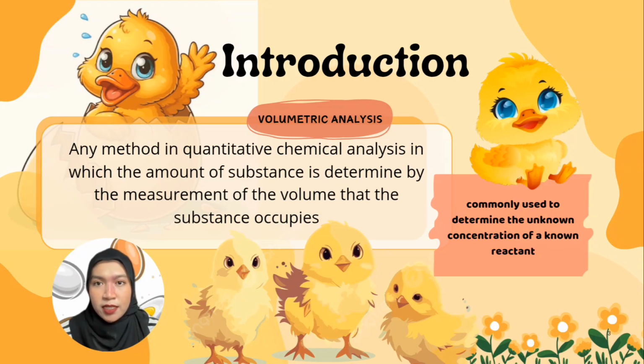Titration to volumetric analysis. Volumetric analysis is any method in quantitative chemical analysis in which the amount of substance is determined by the measurement of the volume that the substance occupies. It is commonly used to determine the unknown concentration of a known reactant.